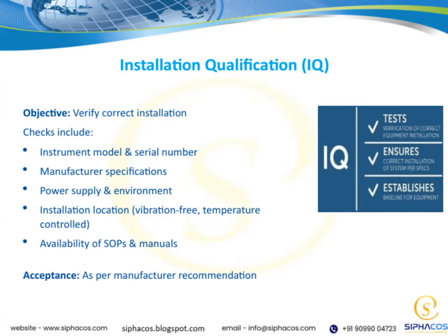Now, let's talk about installation qualification, or IQ for short. The main goal here is to verify that the instrument has been installed correctly. This is a crucial step because proper installation sets the foundation for reliable operation and accurate results.